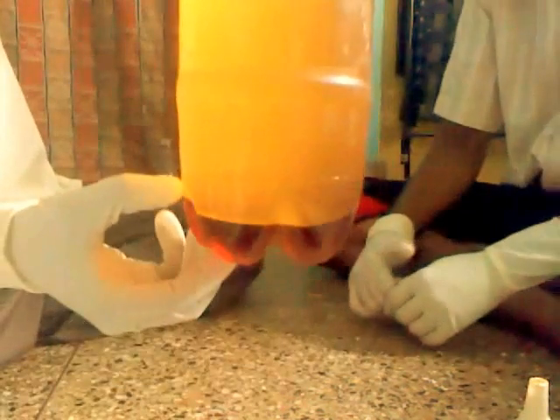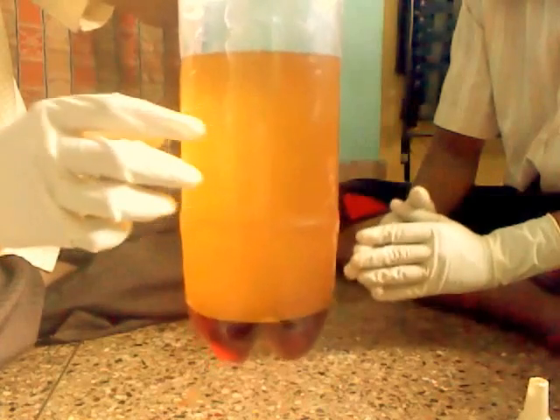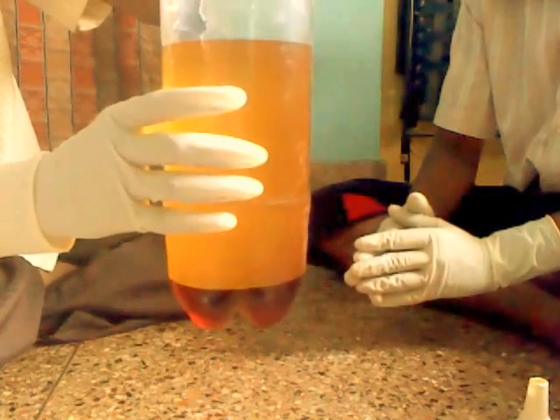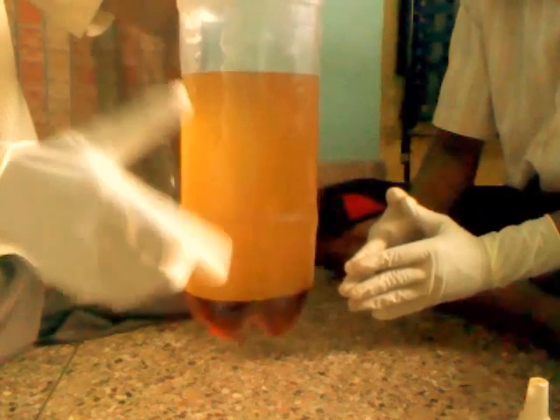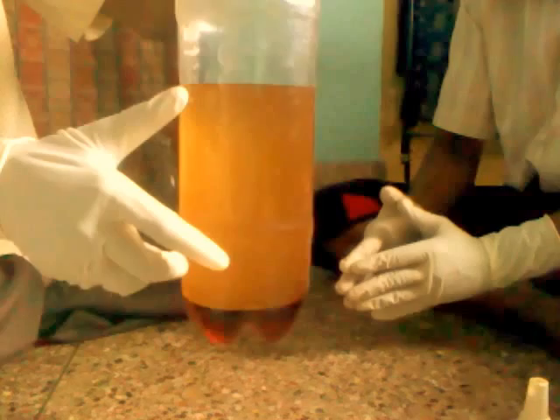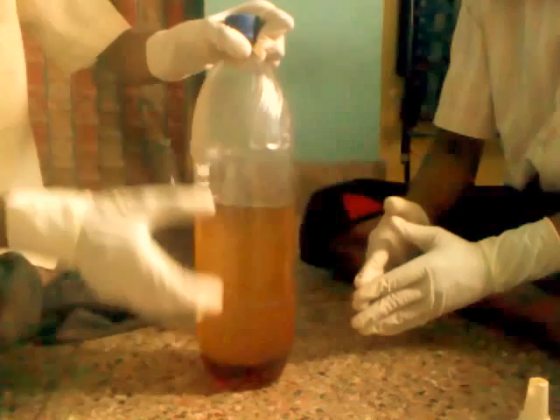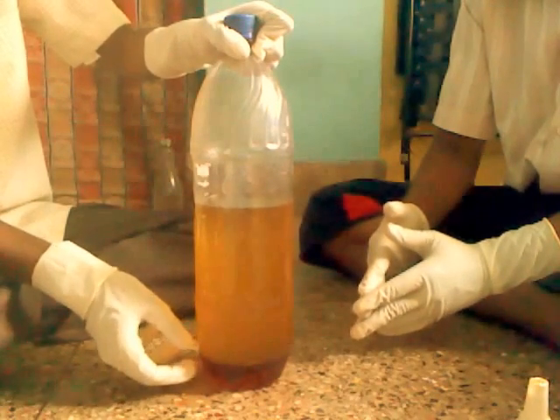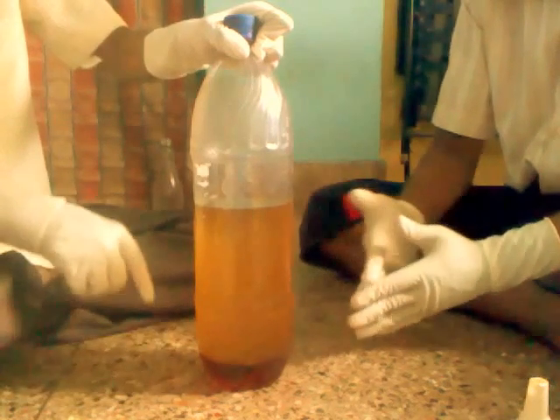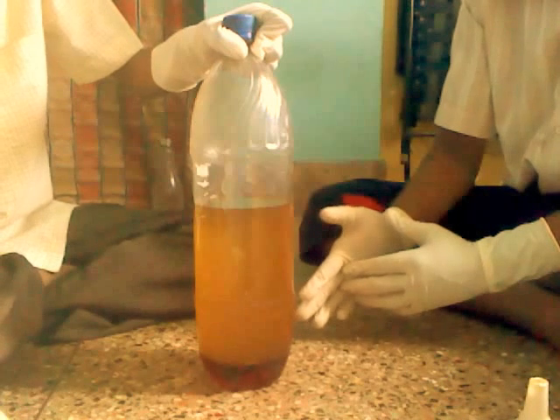The bottom quantity is known as glycerin and the upper quantity is known as biodiesel. This biodiesel is not yet pure, so it can be purified by transferring it into another bottle and pouring the same quantity of water, then shaking vigorously for about 10 seconds. After that, a layer of biodiesel forms at the top and impure water separates at the bottom. From that we can get 100% pure biodiesel.